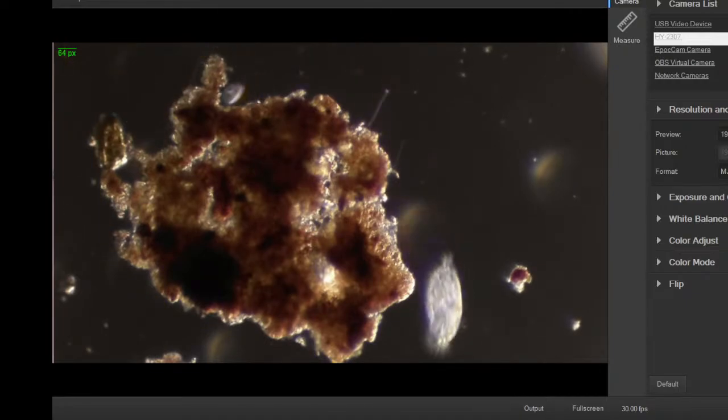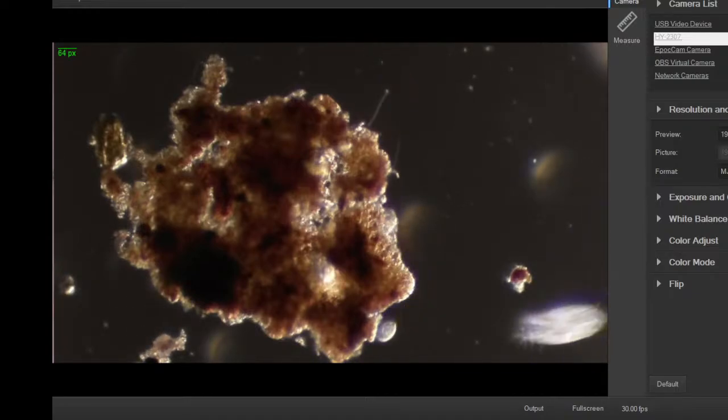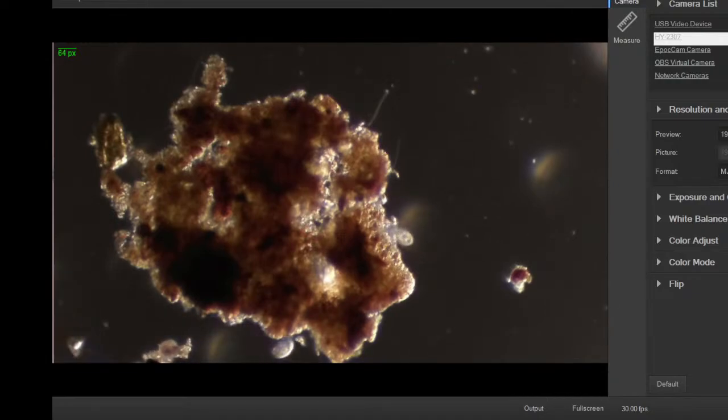Ooh, there's another one. I think that's the second little Stylonychia looking thing coming through. These little guys, I'm not quite sure what they are. They're too fast and too small to identify right now. You can see he's got some stuff stuck on some of his rear, on the back of the cell. I don't know if it's stuck with surface tension or an actual kind of adhesive, but it's got some stuff on the back. Yeah, that one's clean. I think it's a different one.